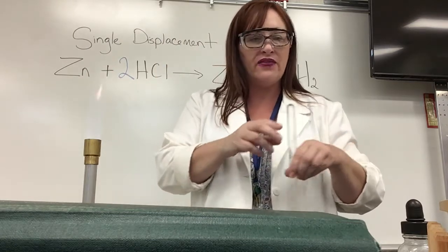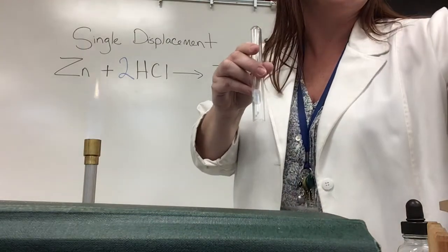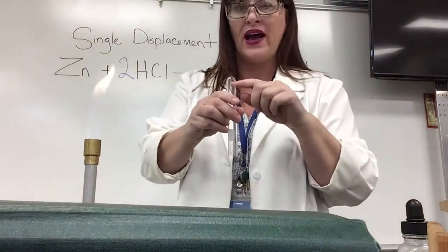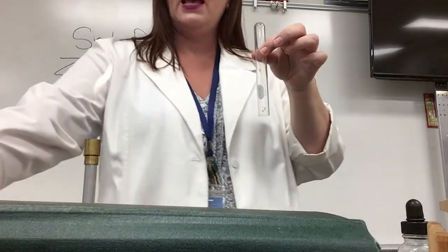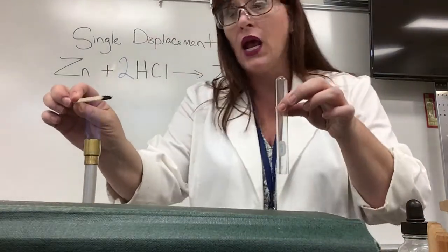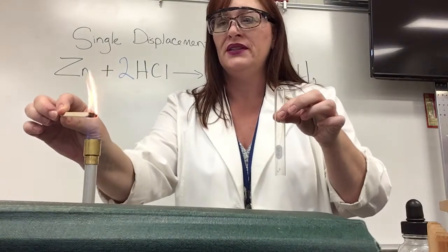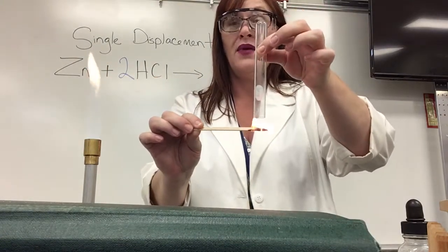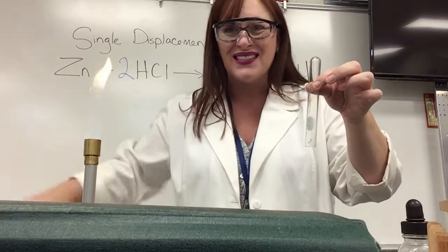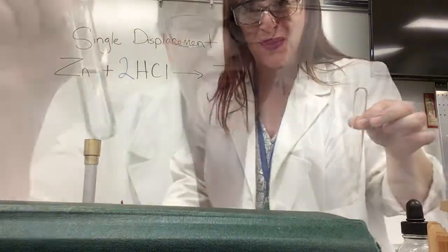So I think I've collected enough and as long as I keep it inverted it's going to be trapped in the top of this test tube. I'm going to hold this test tube this way and I'm going to blow it up, y'all, blow it up. So I've got my burning wood splint and I'm just going to put it over the bottom and that sound that you heard was the sound of that hydrogen gas exploding.